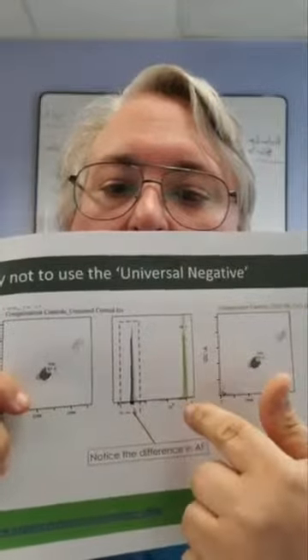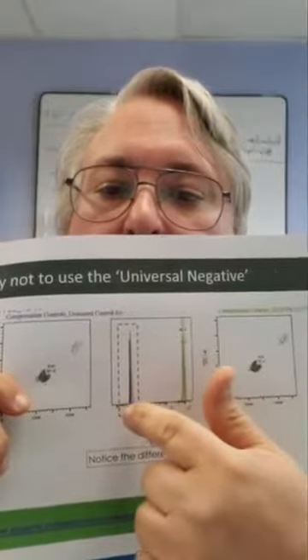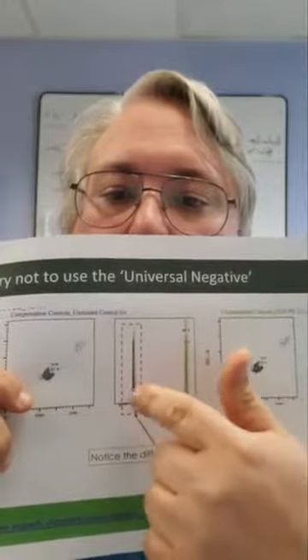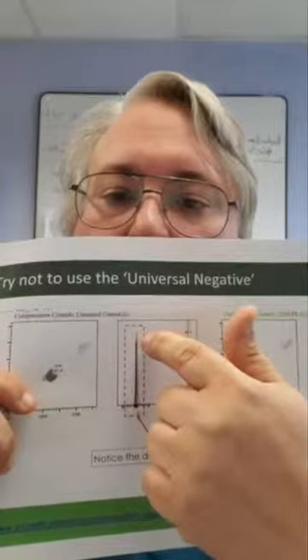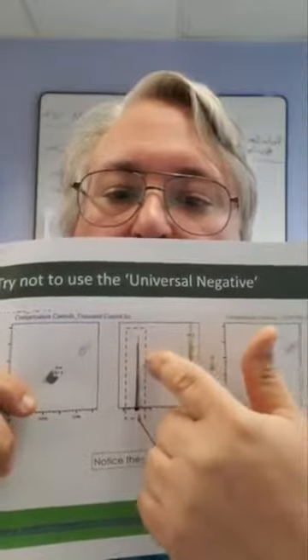In the middle, we have the histogram showing the unstained universal negative in blue and the stained in green. You can see a positive signal here. I've highlighted in this red box the blue that represents the negative, but you can also notice that the green is there too, and that is coming from our positive sample.